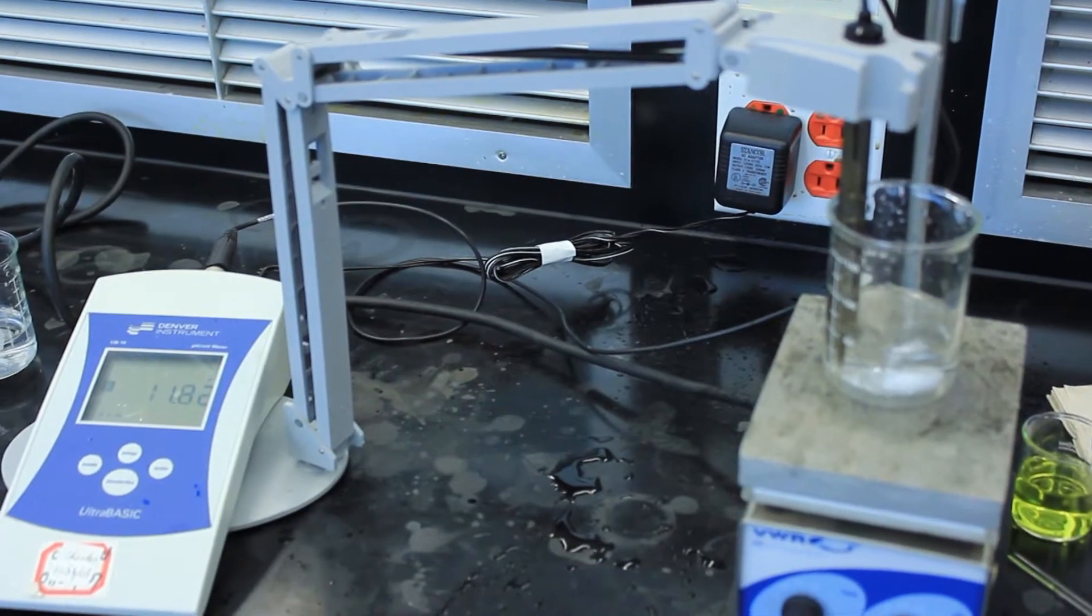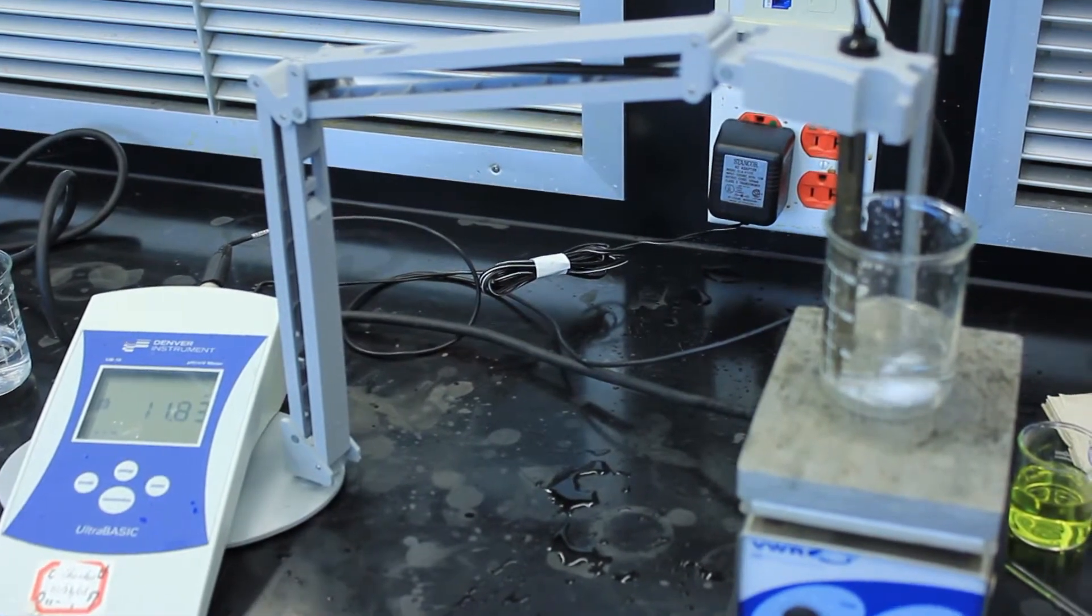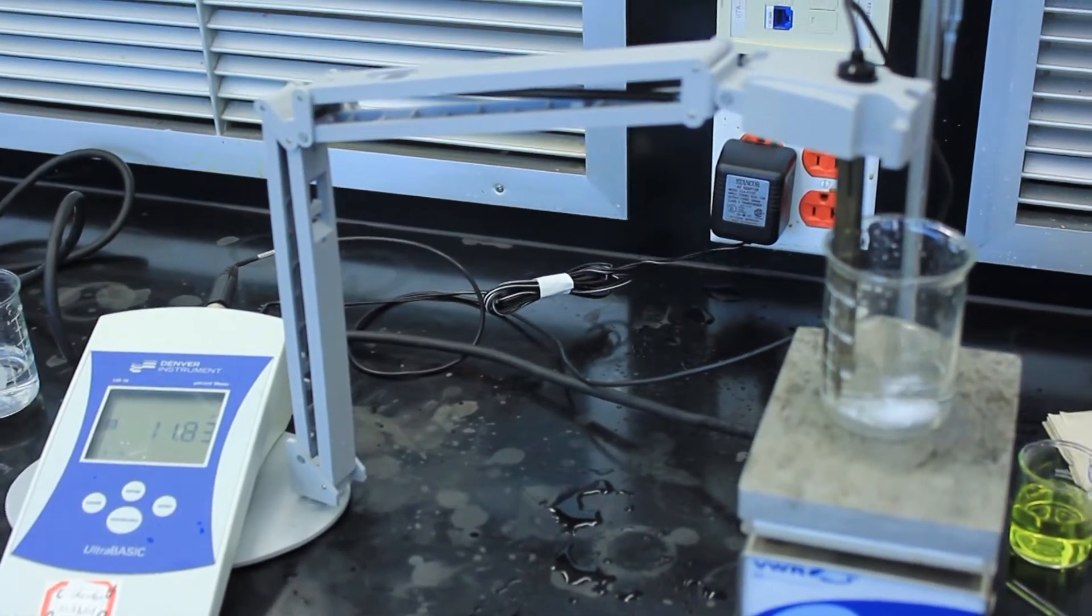If you shoot past your equivalence point without ever getting close to it, rinse out the nitric acid, get some more, and repeat the titration.